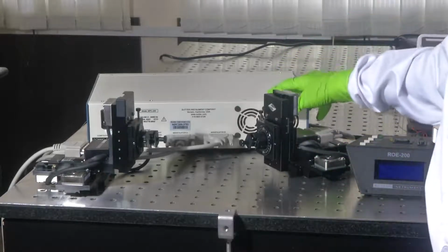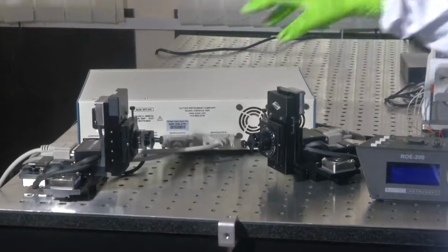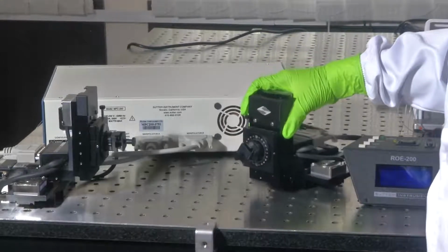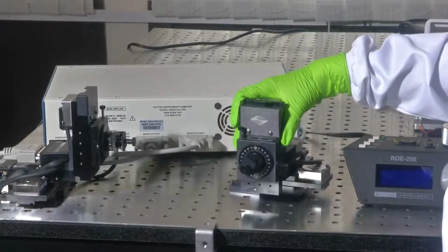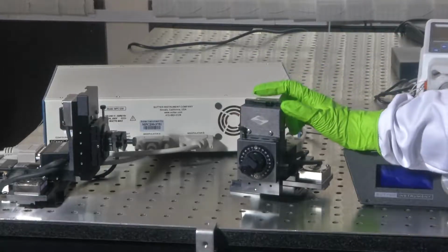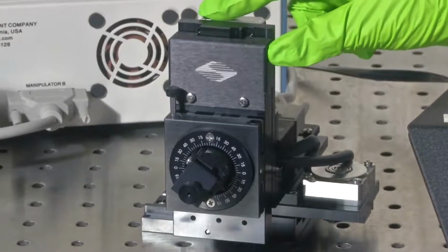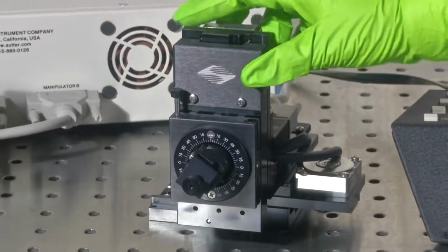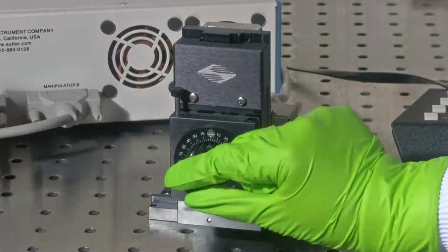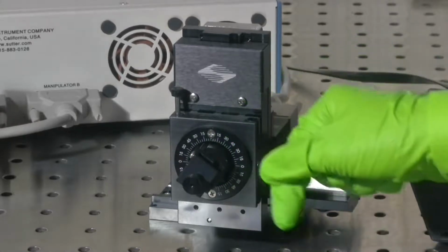Now that we have seen how the power unit is connected to the rest of the units, let us see the features of the manipulator. This is the manipulator B. Here the knob which is provided is for the tool holder.